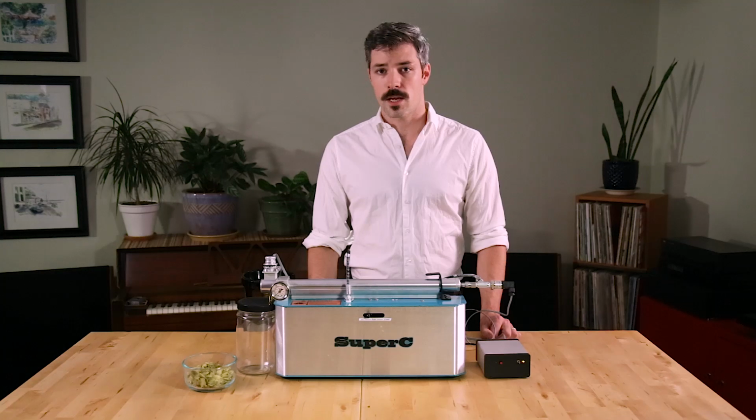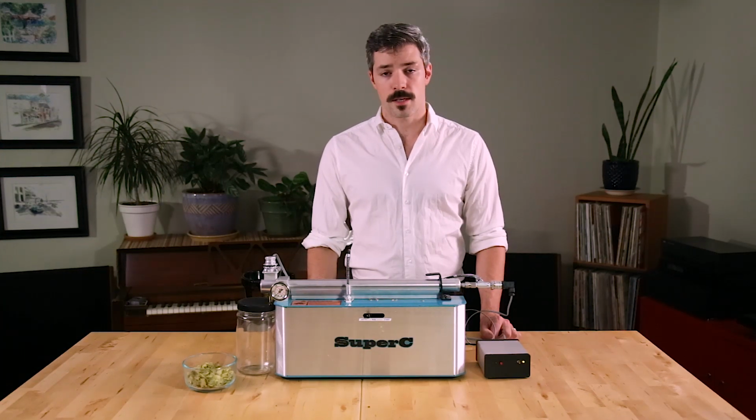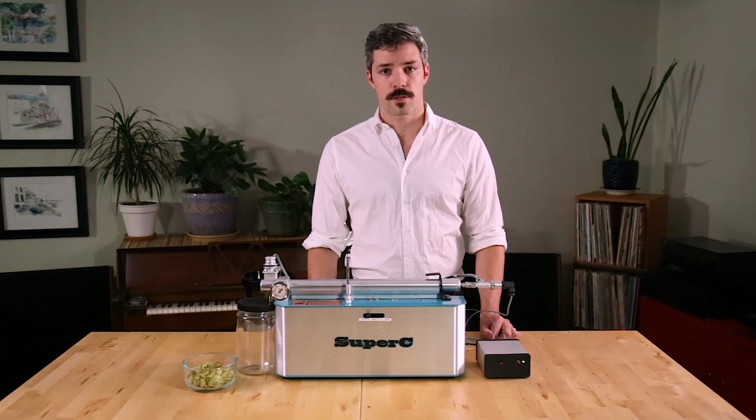This is a great starting point for any material that's high in resin, as opposed to a material that's high in terpenes. Terpenes, being a lighter compound, extract better at a lower pressure and temperature.